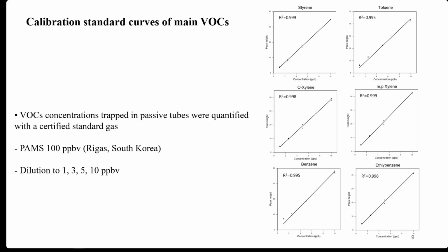To ensure the precision of the experiment, gas standard analyses are performed after analyzing 7 samples for each concentration. These procedures involve routine checks following calibration to verify that the system constantly operates with the set calibration parameters, ensuring reliable performance over time.